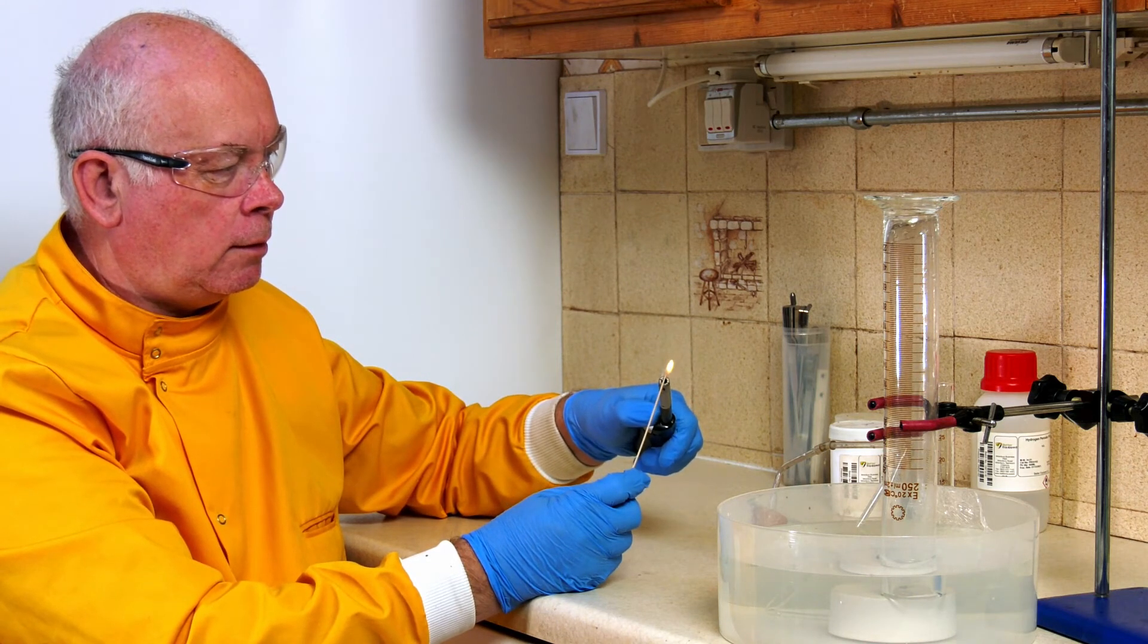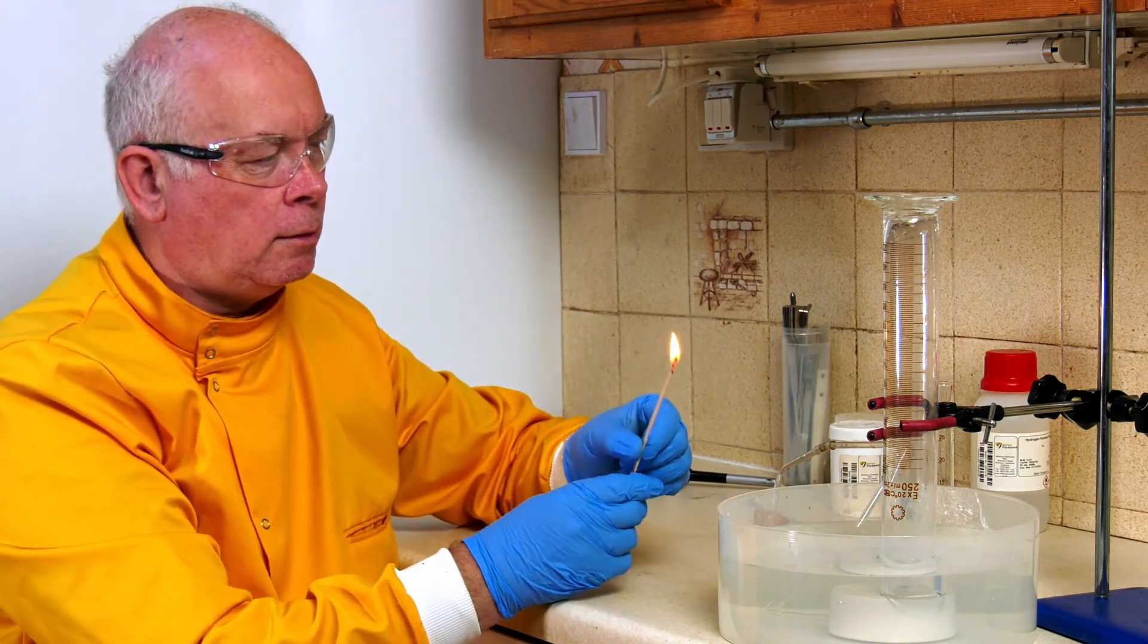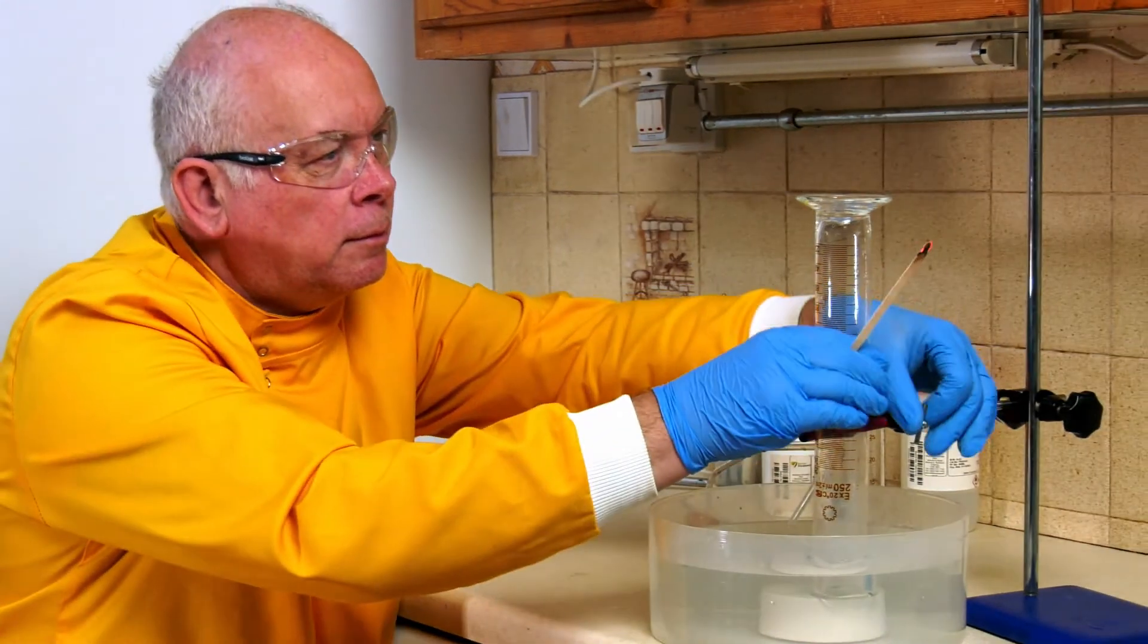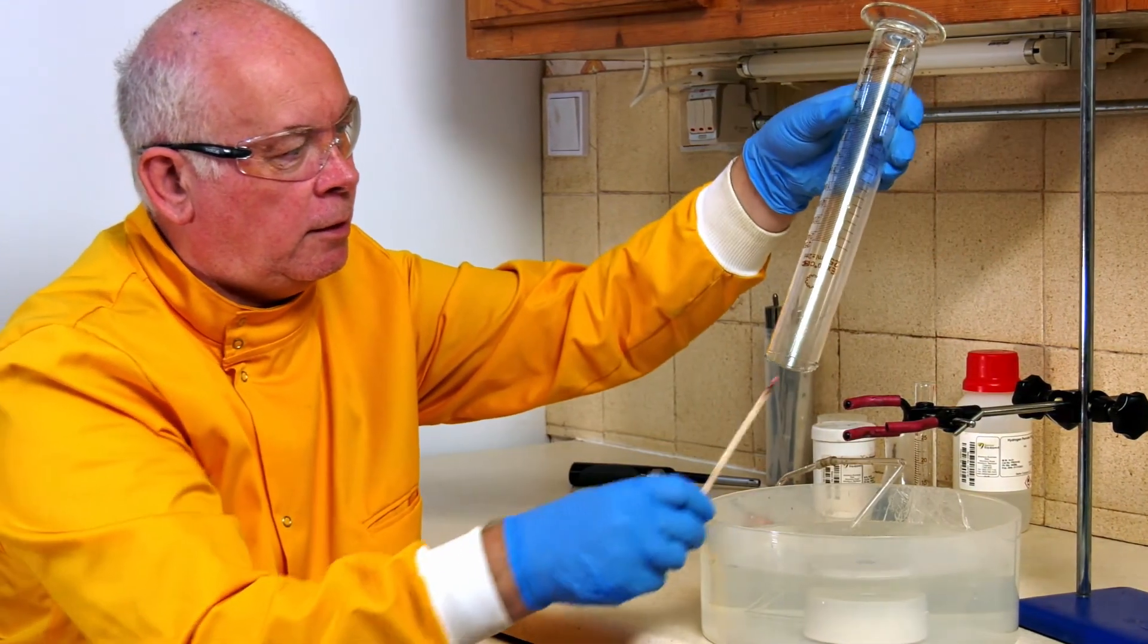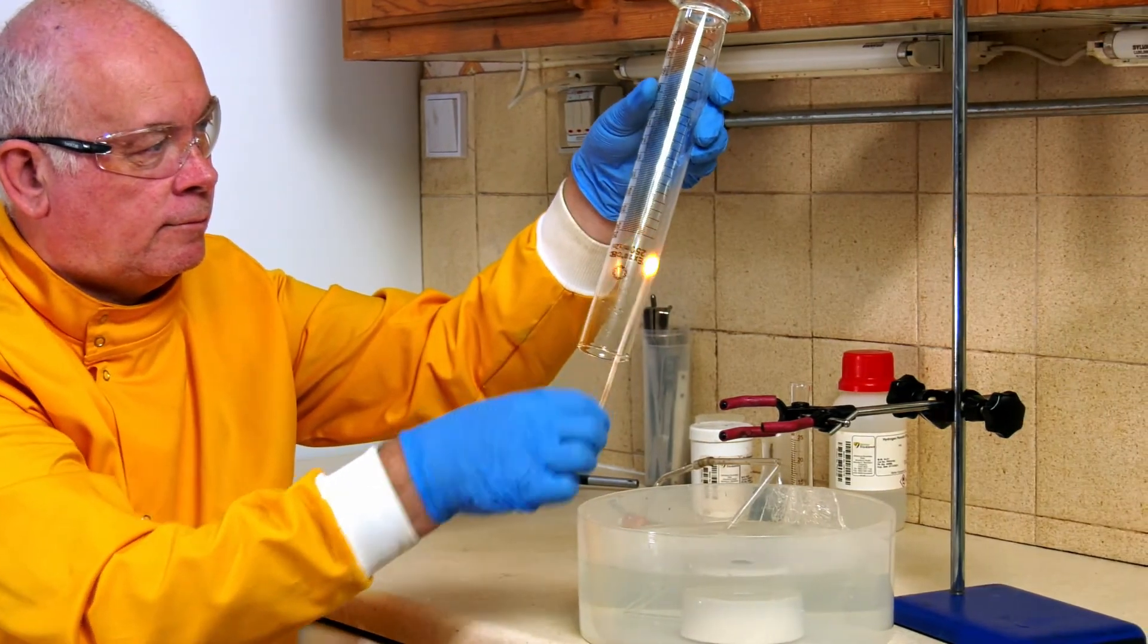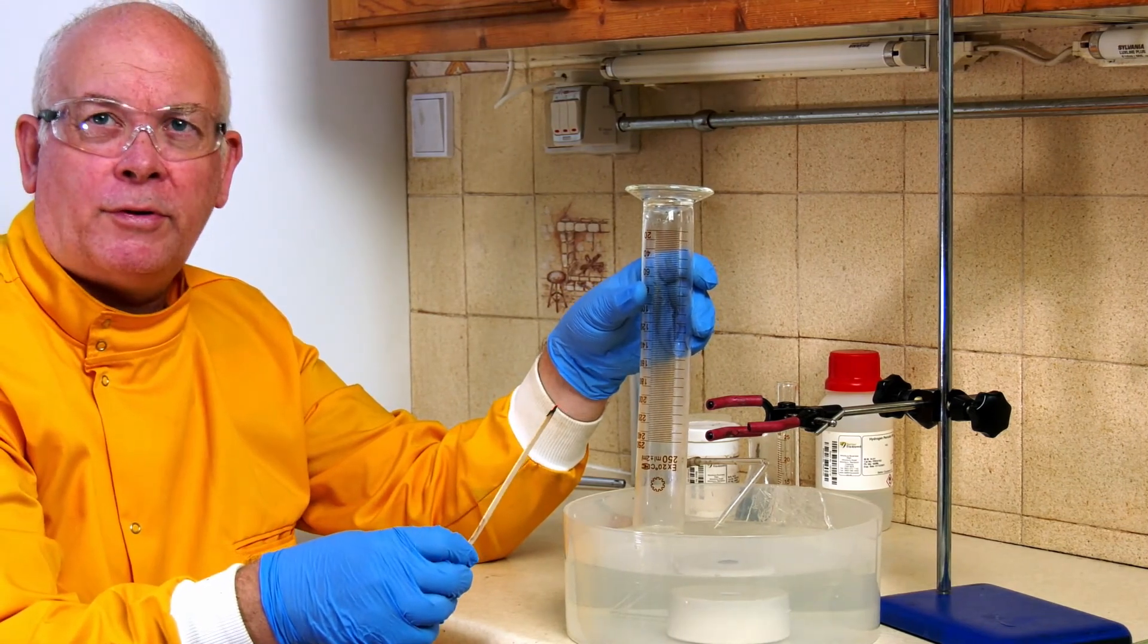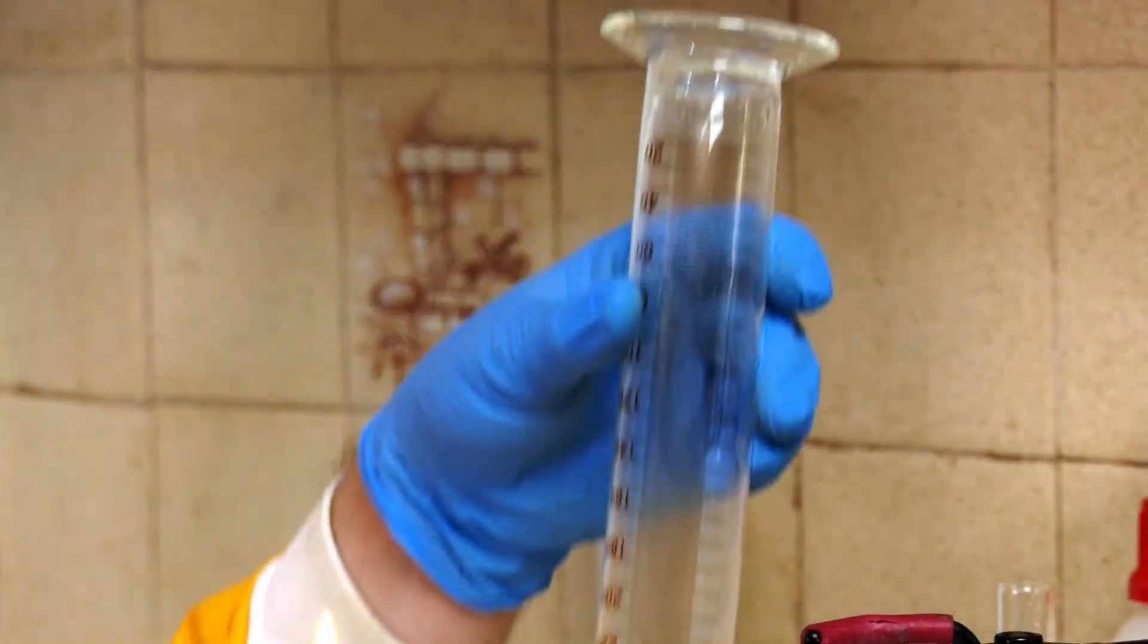If I take a lighted splint - and it's still glowing at the side - what I'm going to do is make it go out. It's still glowing, and what I should be able to do is relight it by putting it into oxygen. Do that again. And I imagine we can do a third time for good measure. And there's our evidence - we've actually produced oxygen gas.